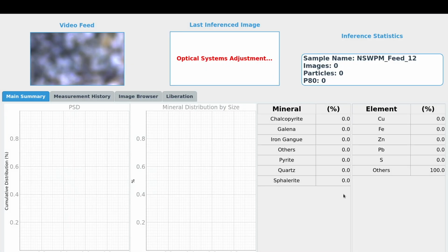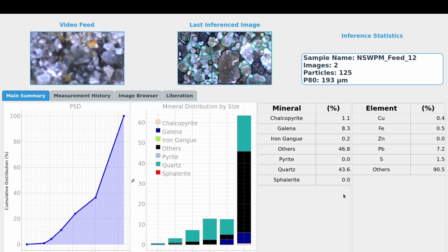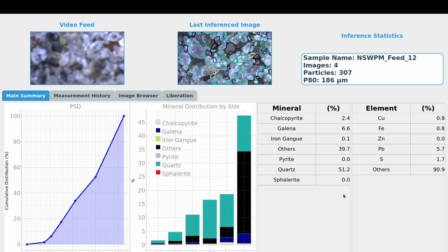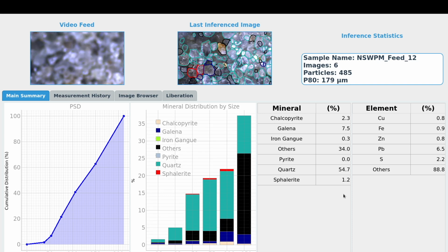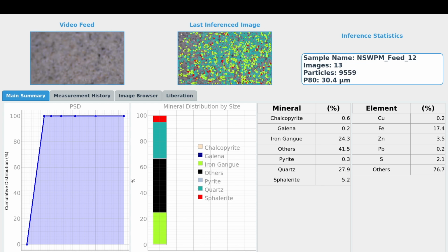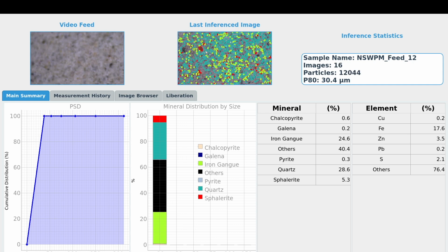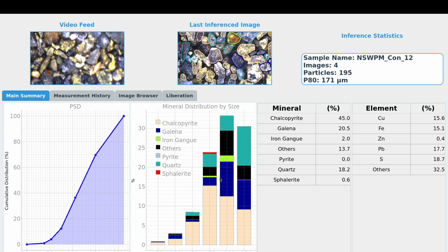The automatic analysis now starts. The optical systems take a moment to adjust. And Emago now scans and analyses every cuvette. It alternates between coarse and fine subsamples in the individual cuvettes. There is nothing more to do until the run has finished.